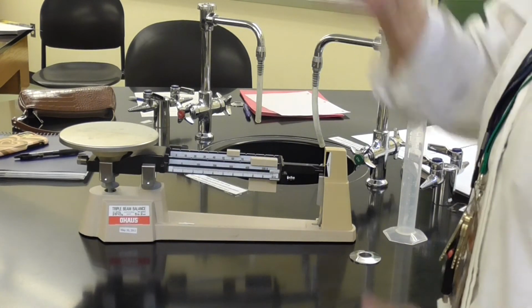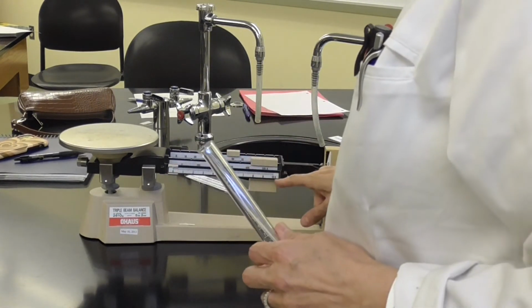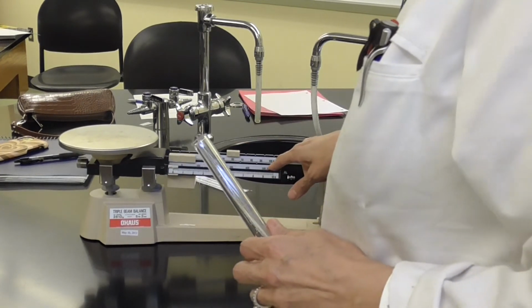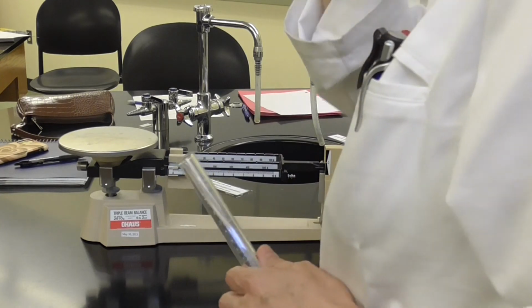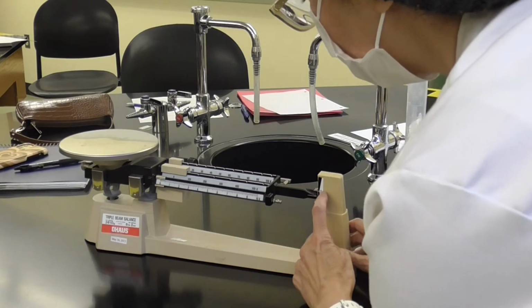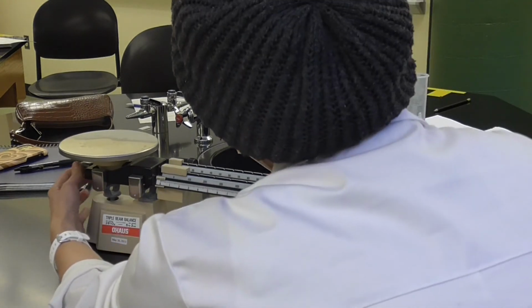This is empty, right? Before you start, do you see those different scales here? One starts at, you know, graduated 10 grams. This is 500 gram, and this is 100 gram. So everything should be at zero before you start. You see the level here? The line should be aligned with zero. It's very, very sensitive. So let me sit down. And you see this one line is not aligned with zero. So I have to bring it up.